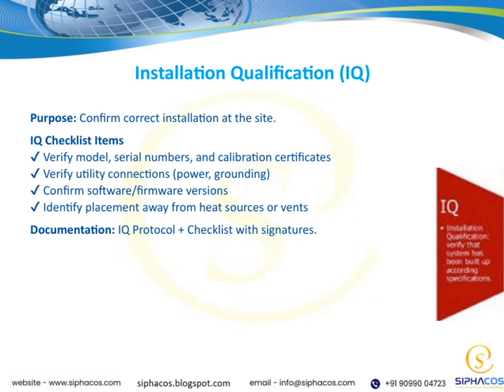Additionally, we need to identify a suitable placement for the equipment. It should be positioned away from heat sources or vents, as these can affect its performance or longevity.